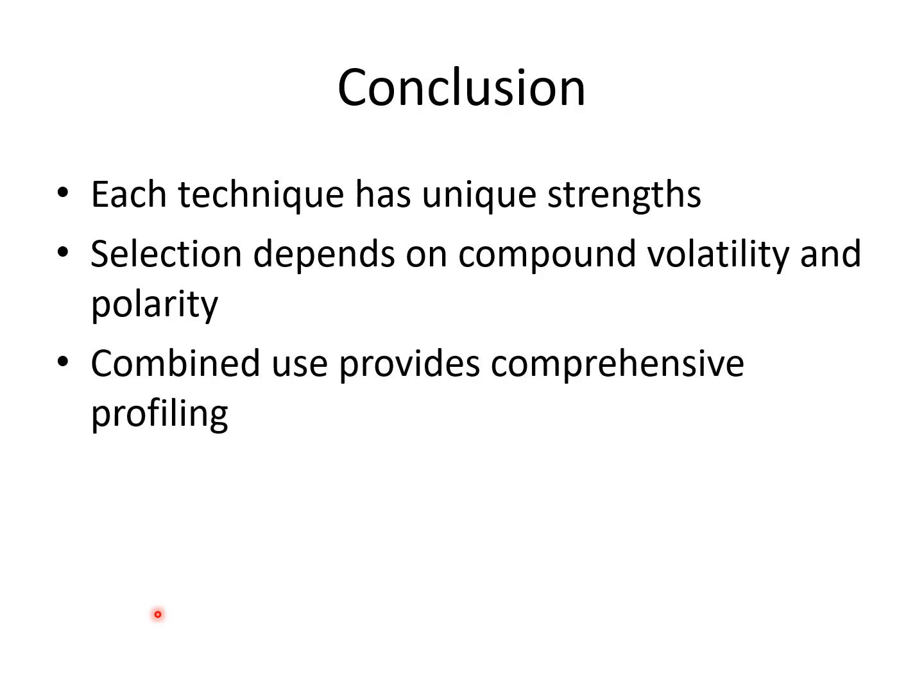However, a combination of two or more of these methods provides a comprehensive profiling of microbial analysis.